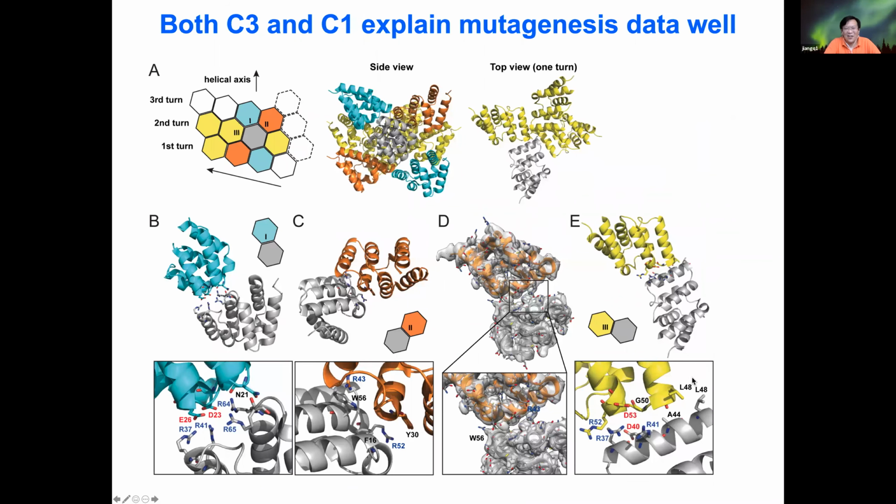This is a very good question, because we actually worried about this as well. It's actually not. I mentioned during the talk that the chemical group, the nickel NTA, is about 20 angstroms away from the surface, and also the linker between is quite flexible, such that the orientational change of the molecules is still fairly random.